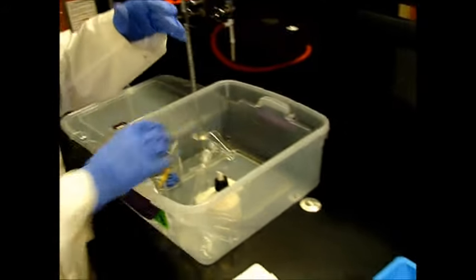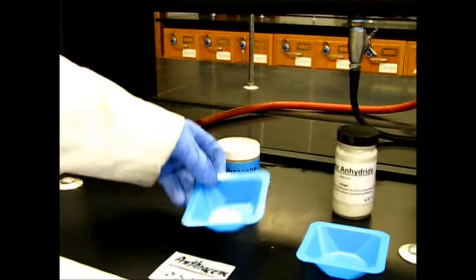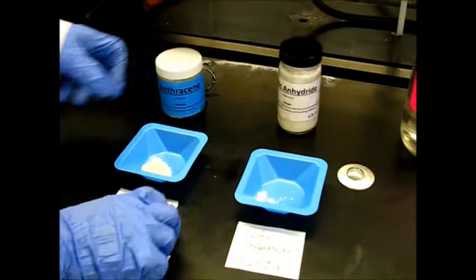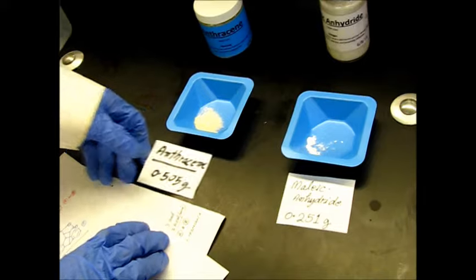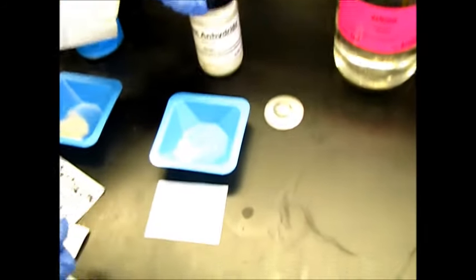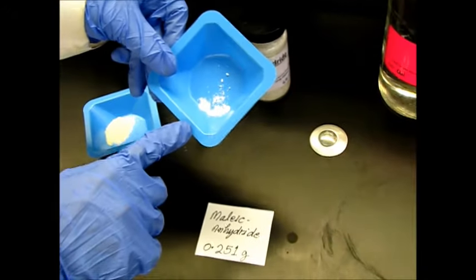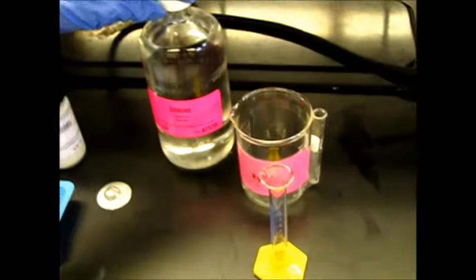So these are the two reasons. And here is our glass apparatus. And here we have our anthracene. Anthracene is slightly yellow in color. And we have already weighed around 0.505 gram. And here is the maleic anhydride, which is white color powder. Here you can see this one. We have weighed around 0.251. And this is the xylene.